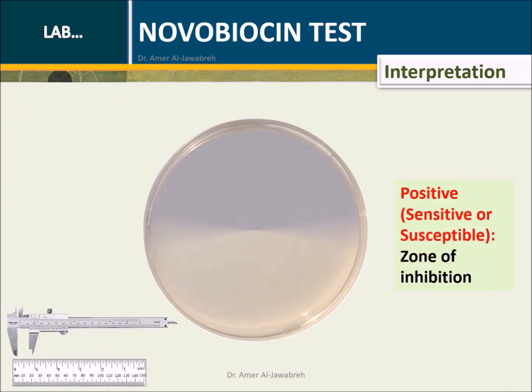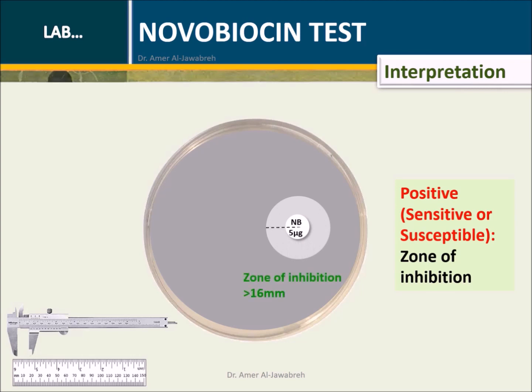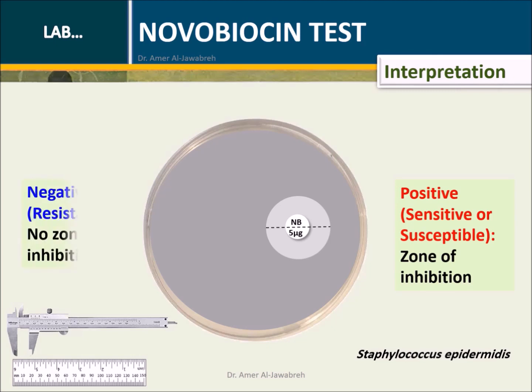Interpretation: Using a ruler or caliper, measure the zone of inhibition for both disks. A zone of inhibition greater than 16 mm is considered sensitive, and thus diagnosed as S. epidermidis. A zone less than 16 mm is considered resistant, and thus S. saprophyticus.